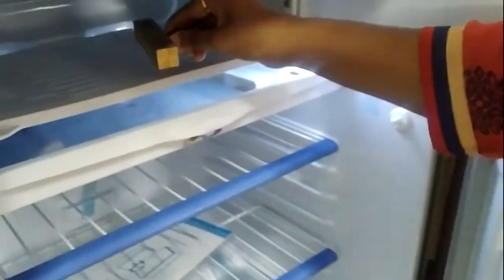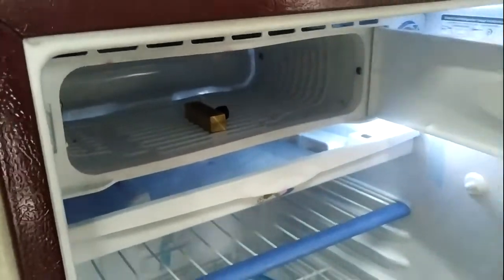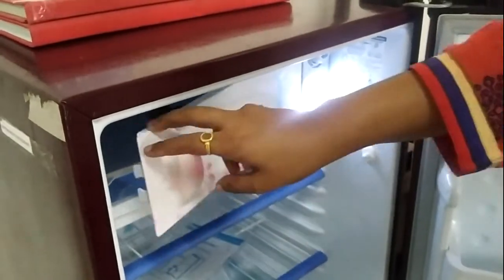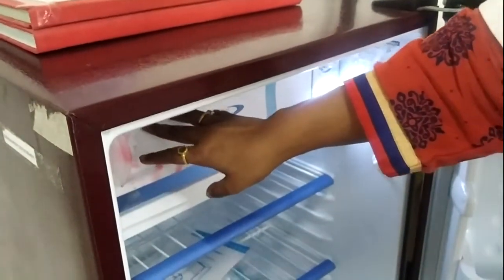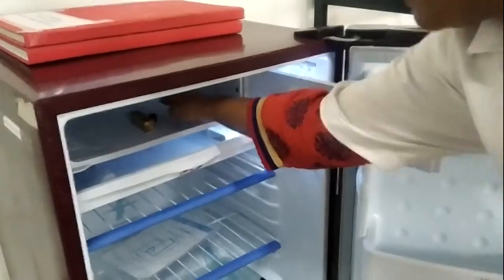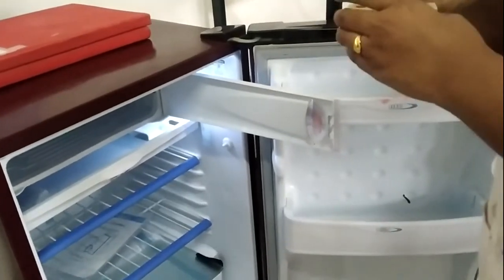Now I am going to put this overfilled suppository mold into the freezer and freeze it for the next few hours till the suppositories are formed. After a few hours our suppositories have formed and frozen properly.